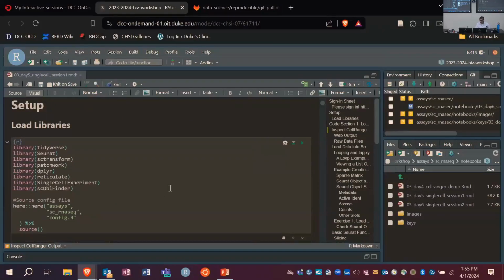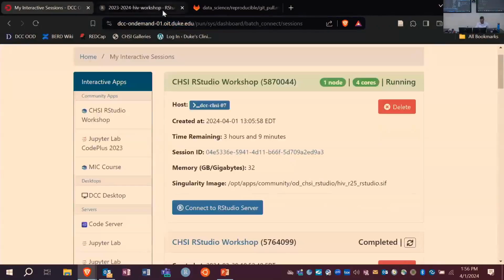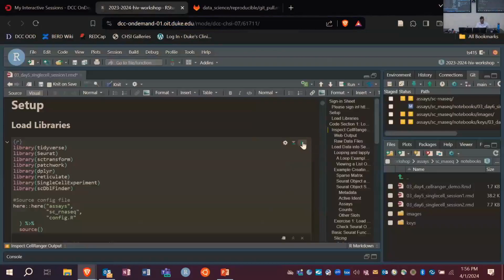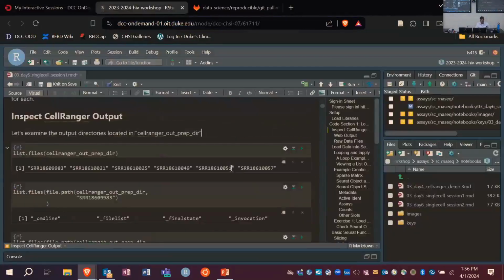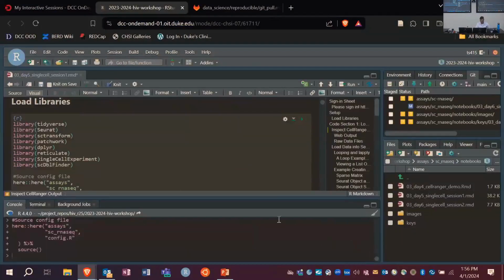I hope it's not going to be super slow. Still, yeah. There we go. Okay.